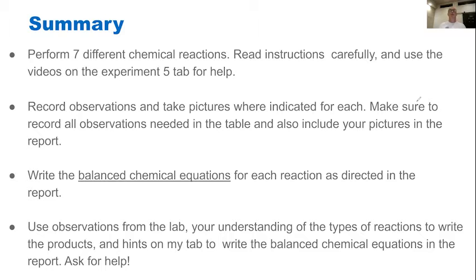And the most important thing for this lab tonight is to carefully record all your observations. So hopefully you've got a notebook or something. Just write down everything you see, everything, because that is key to the whole report. I've got a lot of really bad ones from last term, where when they looked at the combustion reaction, they didn't mention that it got hot, and didn't mention that there was any light created, which are 2 dead giveaways for chemical reactions taking place.